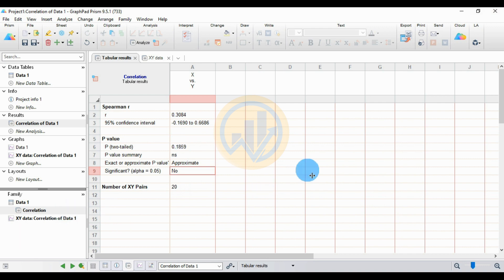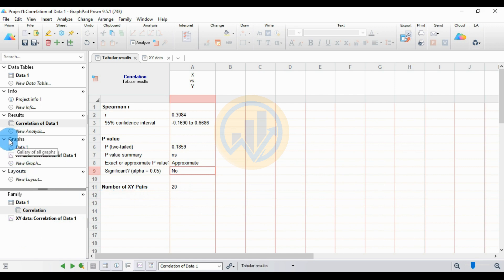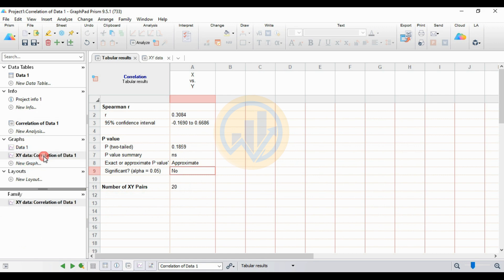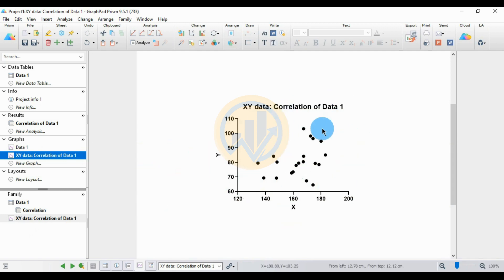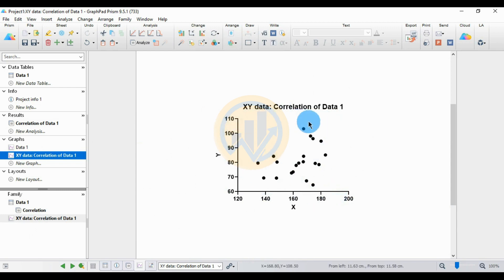Now let's create the Spearman correlation graph in GraphPad Prism. Go to the graph options, click on the XY data for Correlation Data 1, and the graph is already created in GraphPad Prism.